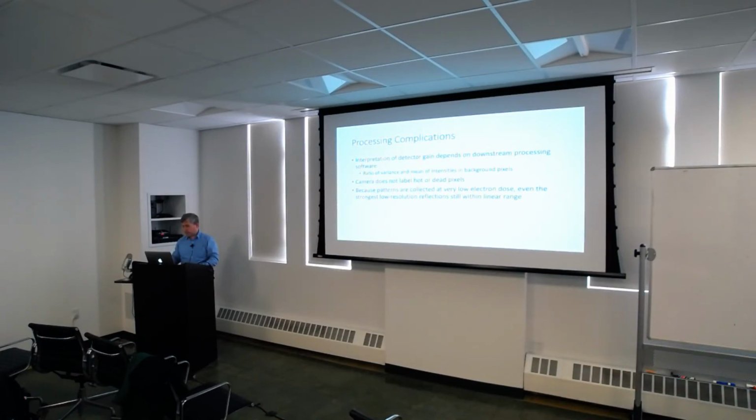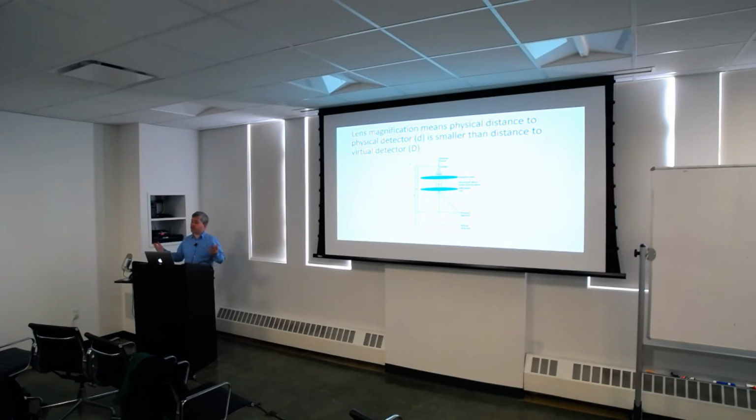Why gold? Well, because gold diffracts. You can get a gold lattice, the spacing is pretty well defined, and you can just buy a gold crystal sample. It could be something else, like graphite, but gold is pretty commonly used in EM for calibration, just because it's easy to get.